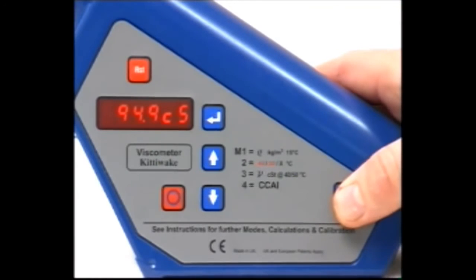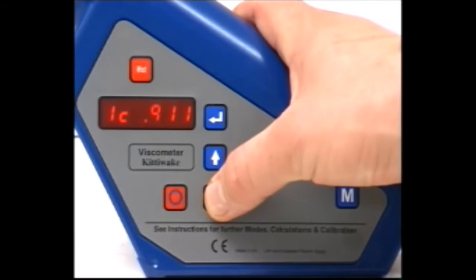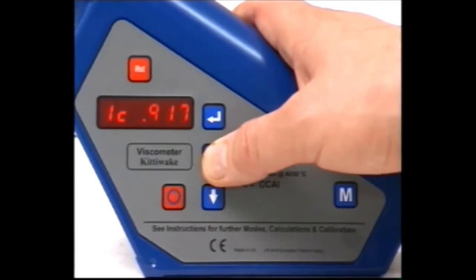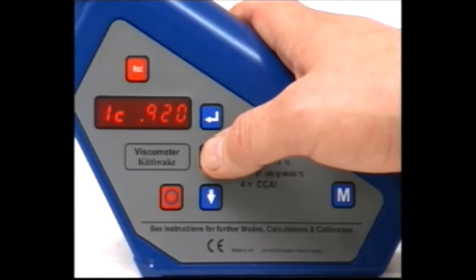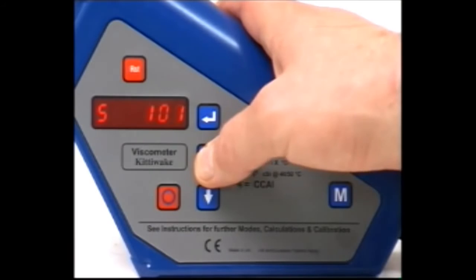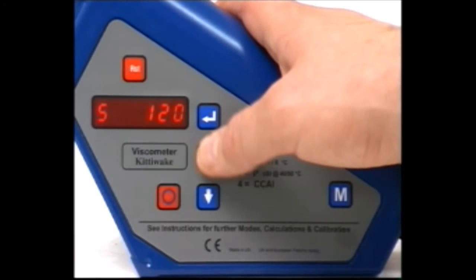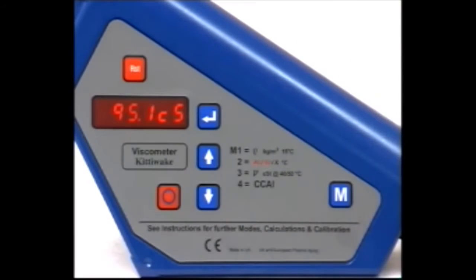For unheated operation with multigrade or synthetic oils, follow the basic procedure for readings at 40 degrees. Then select Mode 1 and enter the figure for corrected oil density. The default setting used is 0.9. Select Mode 5 and enter the viscosity index figure. The default here is 100.